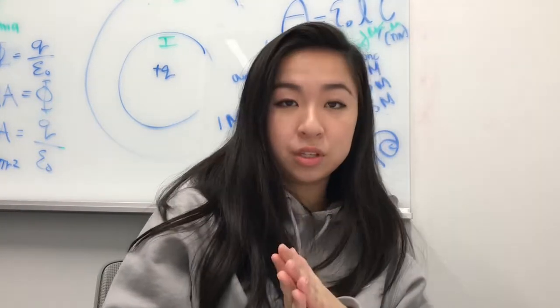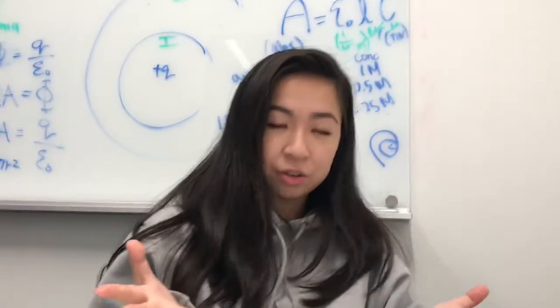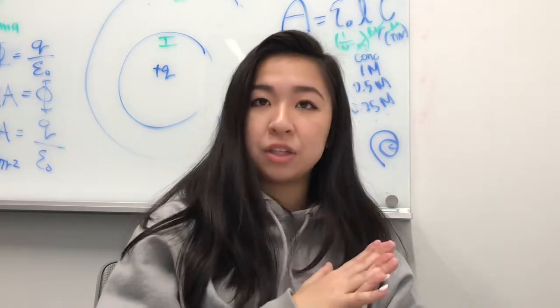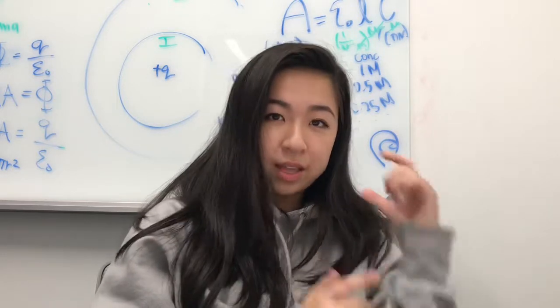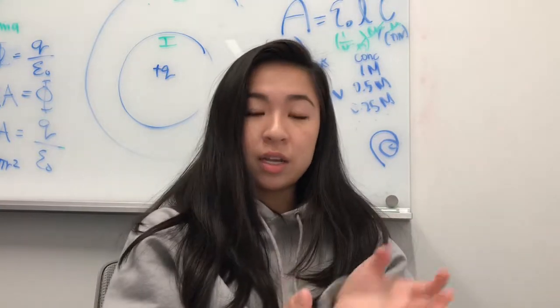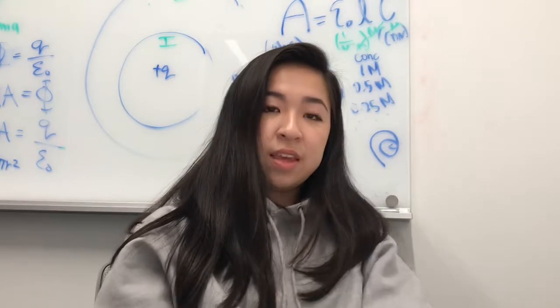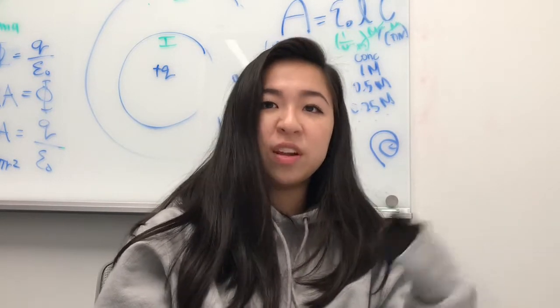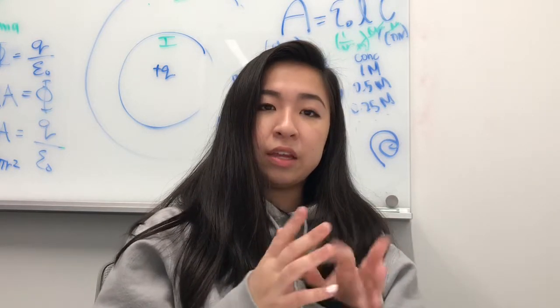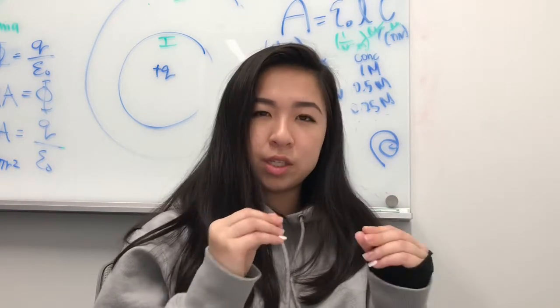Now, instead of alum crystals, if we wanted to grow salt crystals, we could use a similar process and create a saturated solution of water and salt. So I would need to make sure that I added enough salt so that the solution was saturated. So I would boil the water and add salt until no more salt can dissolve. And then we can boil the solution to help it dissolve and expedite the process. But if you just leave the solution, then it'll slowly evaporate, same process as before, and then it'll create little salt crystals.